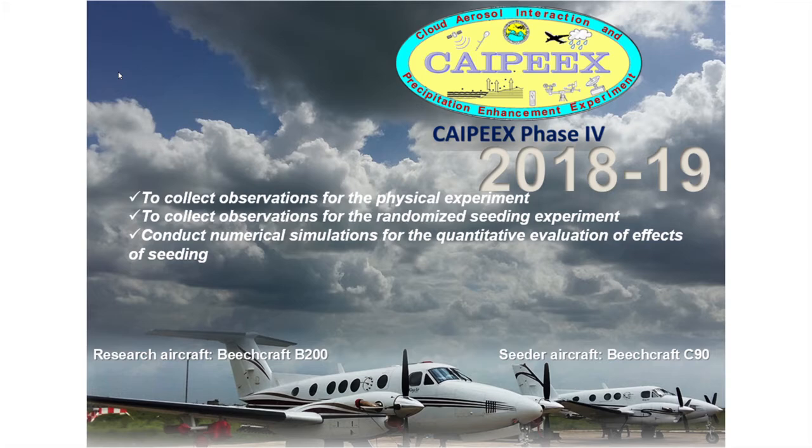I'm a scientist at Aerodyne Research, and I'm going to be talking with you about an experiment called the Cloud Aerosol Interaction and Precipitation Enhancement Experiment. We conducted it last summer in India, and we flew a Beechcraft B200. This is looking at clouds and looking at seeding of clouds. Dr. Thara Prabhakaran led this study. She's at the India Institute for Tropical Meteorology in Pune.